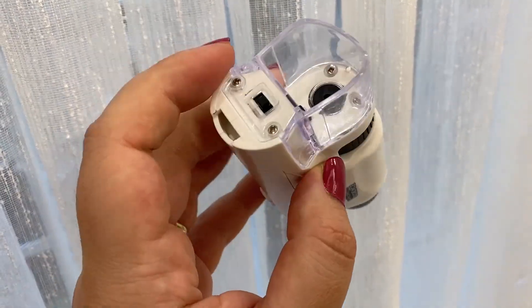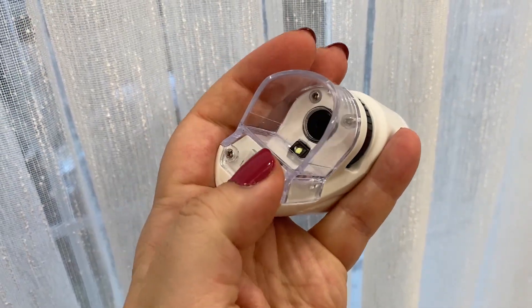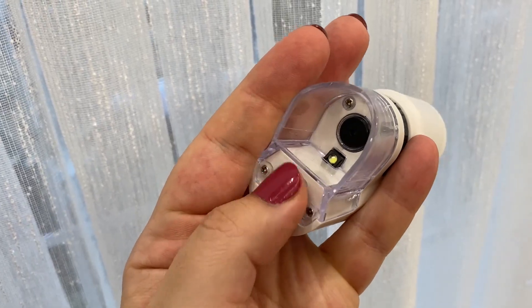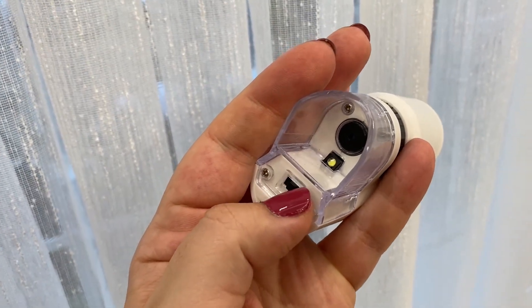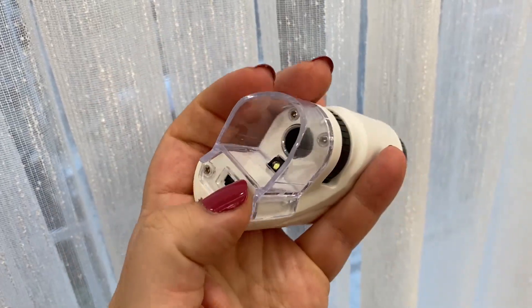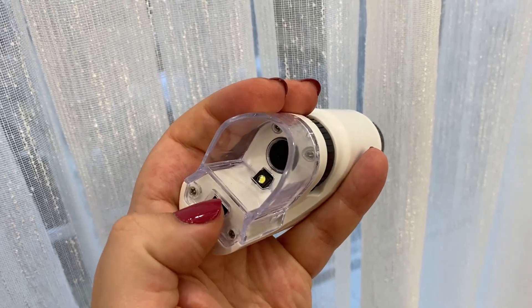I do have a bug with the button I showed you — it's tricky trying to make it work. My button is not really making contact properly, and this is very annoying. Sometimes I try to bang it, sometimes I try to give the button a middle position — whatever.